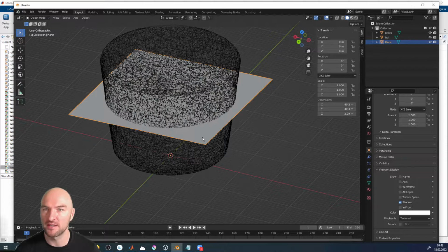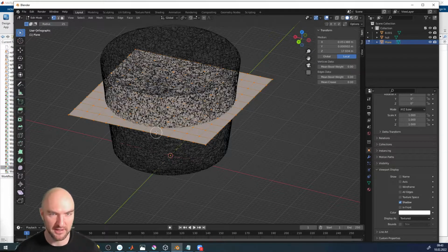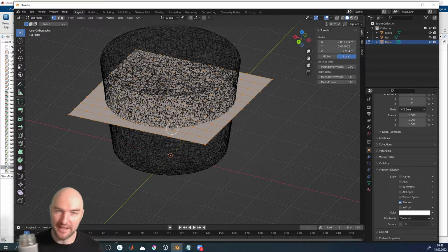So this object is now, what's its size? In X and Y, it's 40 nanometers. So if I divide it into 10, then we have 4 nanometer steps. So if I go in and we have a 9-fold divide, that's 4 nanometer steps. And if it's a good choice or not, again, I don't know. I don't know how dense your data is, how many atoms you have there.